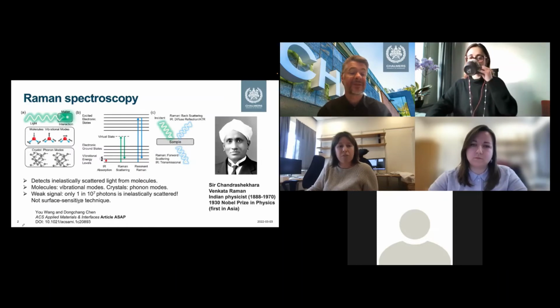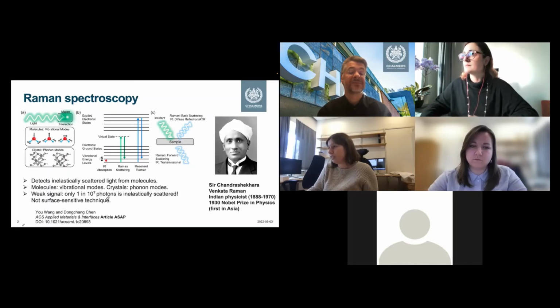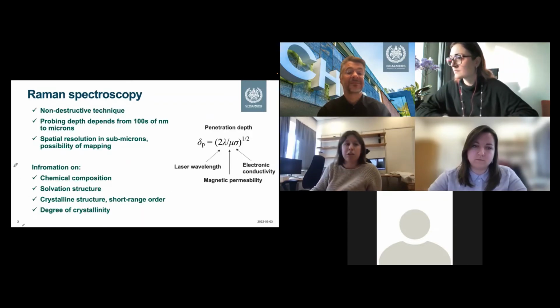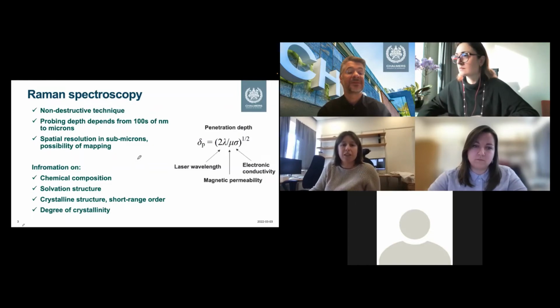Also, keep in mind that Raman by itself is quite a weak signal. Only 1 in 10 million photons is actually inelastically scattered, which also means that the technique is not surface sensitive. I point this out because very often people ask how far and deep into the sample we can get a Raman result, and I will get into more detail on this. As I mentioned, Raman spectroscopy is a non-destructive technique, very useful. It probes depths from hundreds of nanometers up to microns.